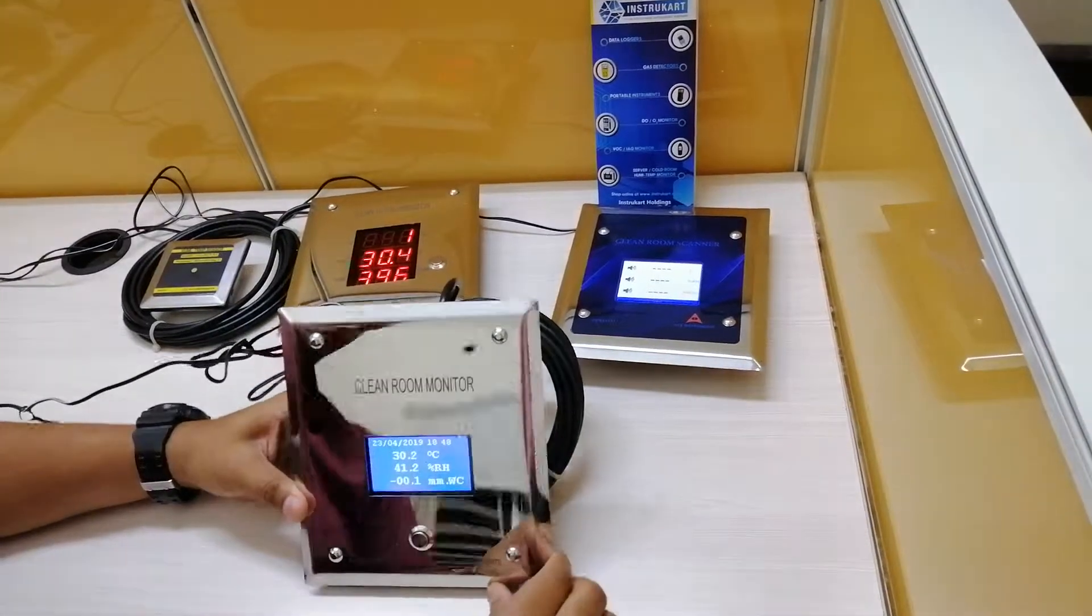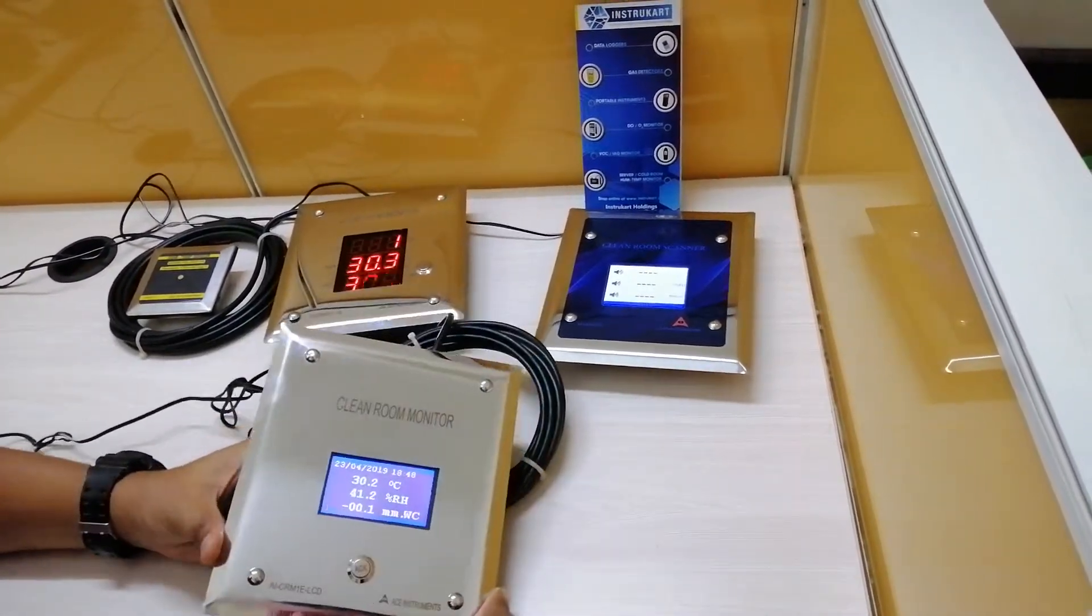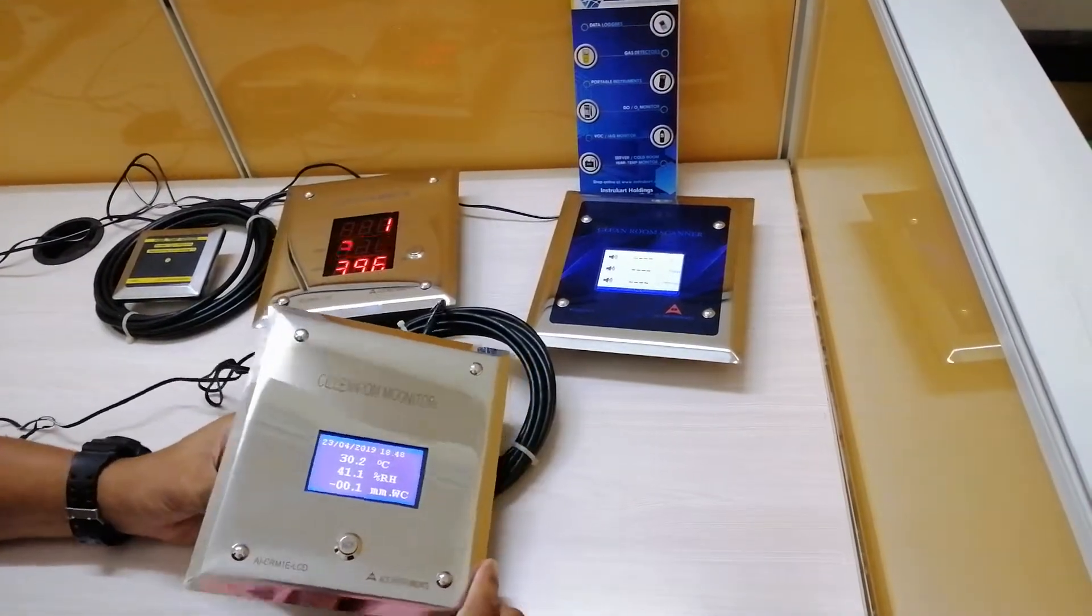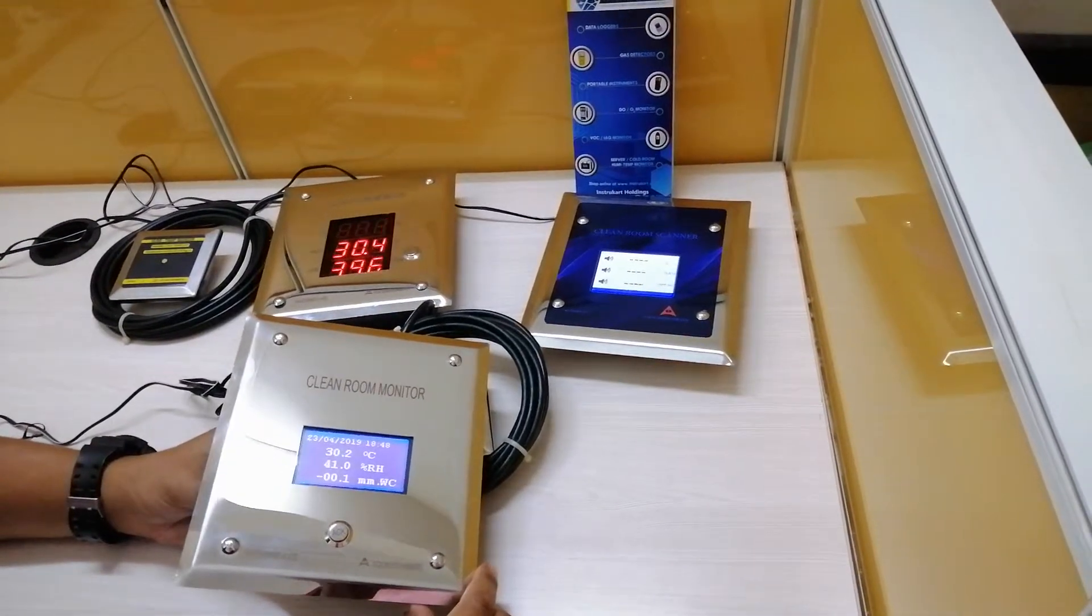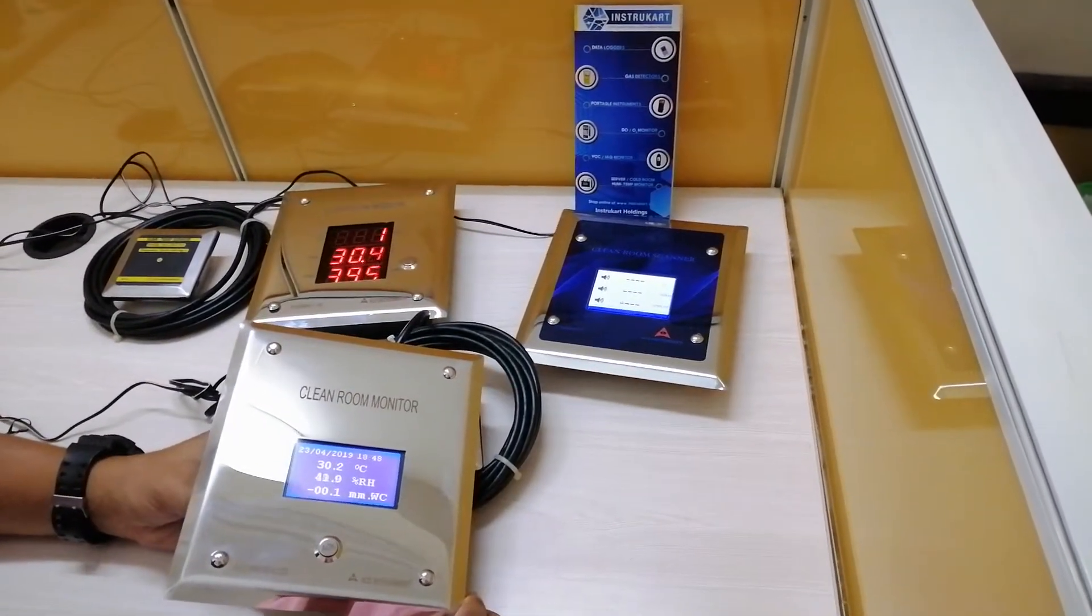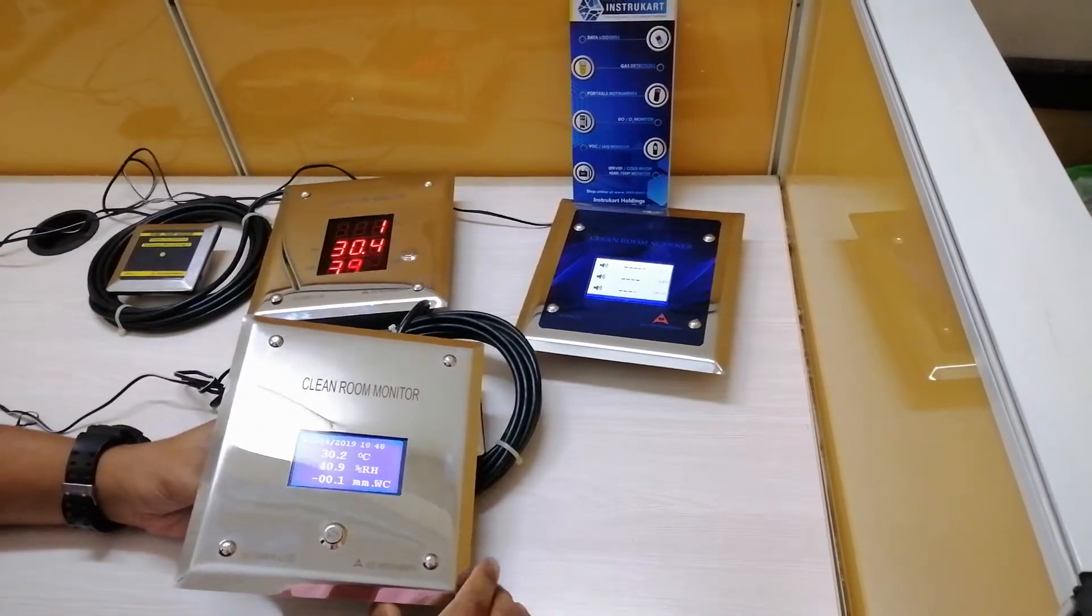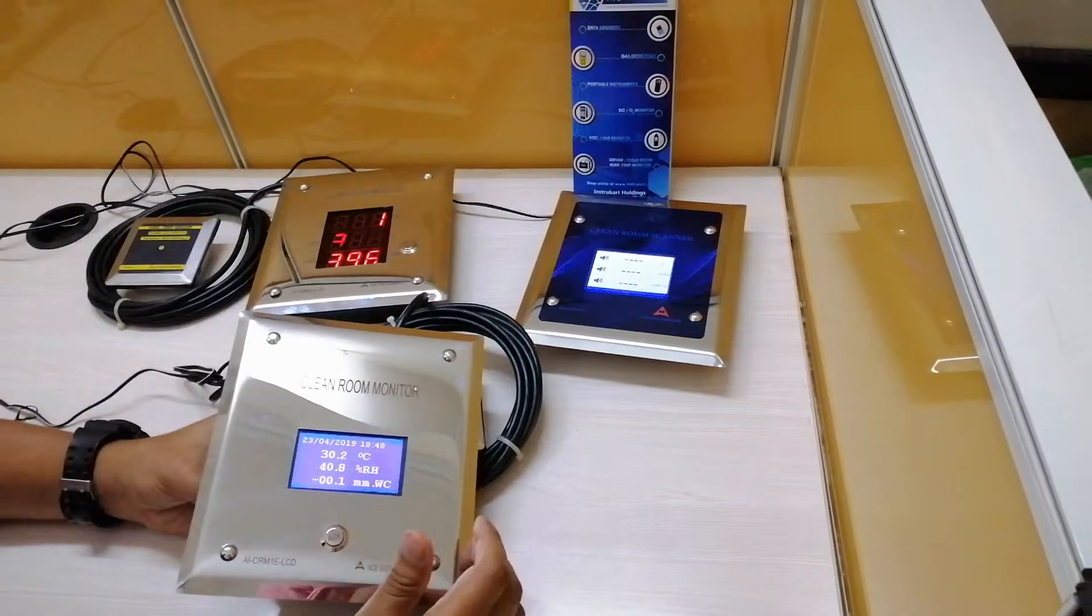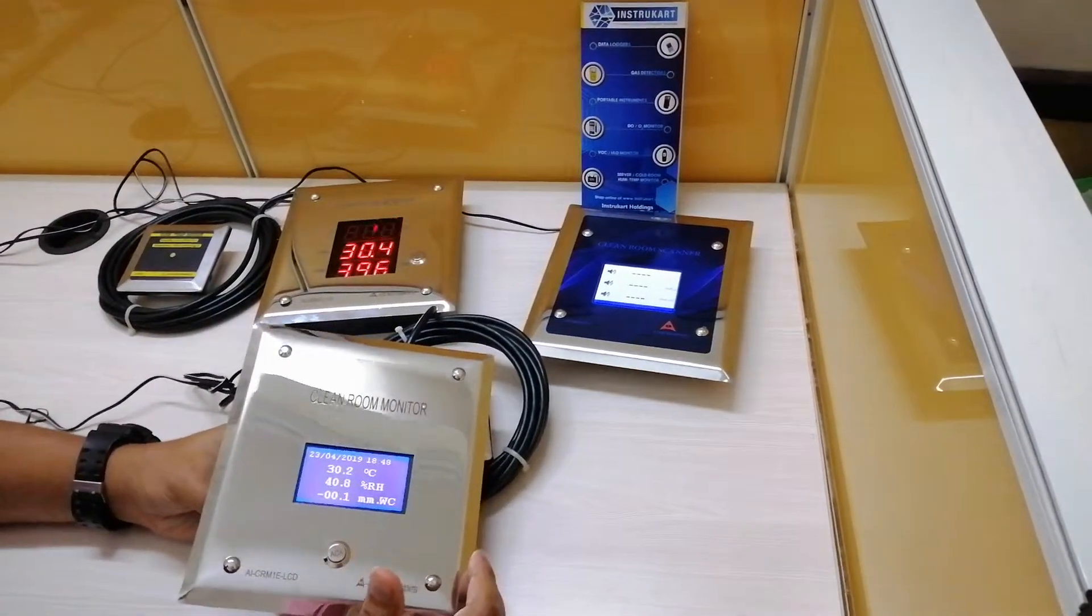The range for temperature is 0 to 60 degrees Celsius and RH is 0 to 100 percent. The differential pressure can be programmed from minus 500 pascals to plus 500 pascals, or it can be read in MMWC also.